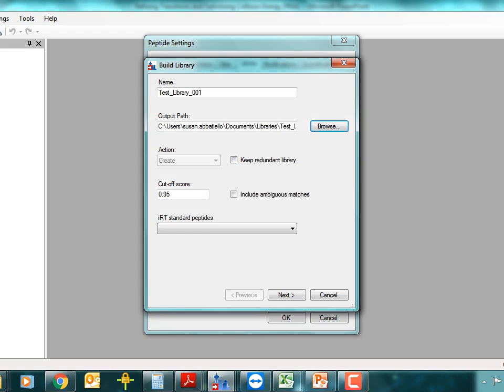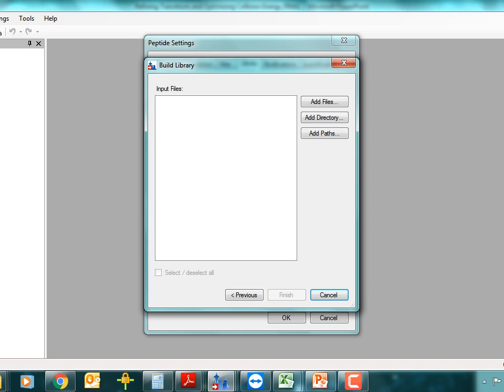And so it just needed that output path front part. And so what it does is it takes the name for your test library that you put in there and it tacks it on the end. So you need to have the output path. So that should be pretty straightforward. Is everybody with me so far? Okay. Next. Yes. So this part is also kind of easy.